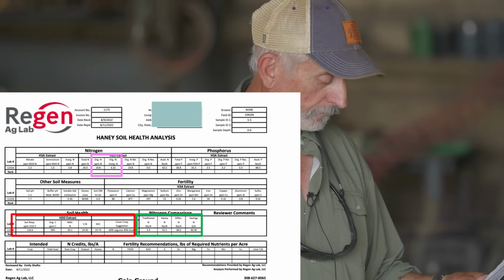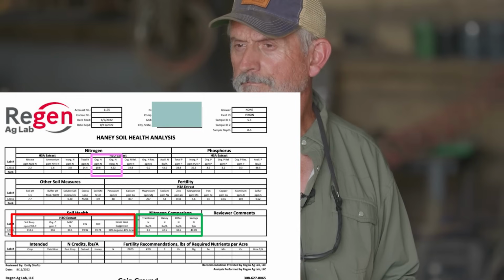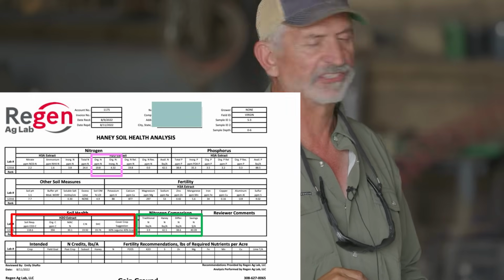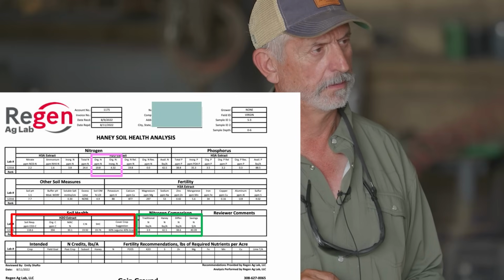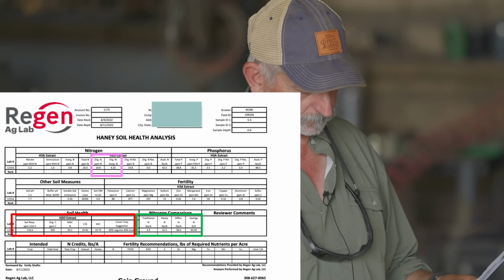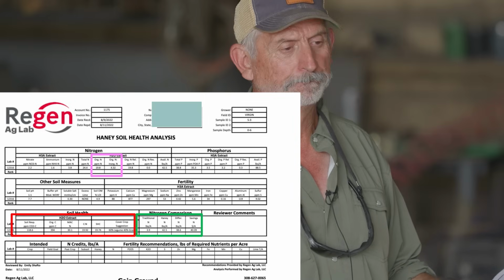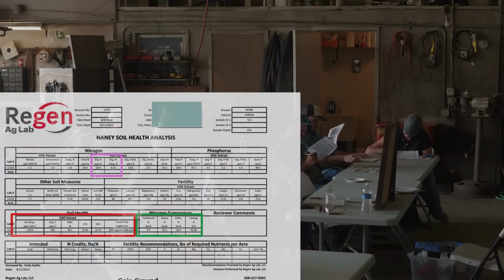Okay, 30. And the soil health score is 19.74. And that hasn't been grazed for years and is unhealthy grass. Has not had cows for years. Now read the nitrogen. 3.9. And the Haney test is showing 42.5. Showing a savings of what? 40 buckaroos.